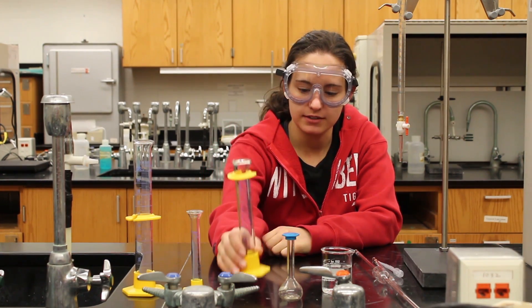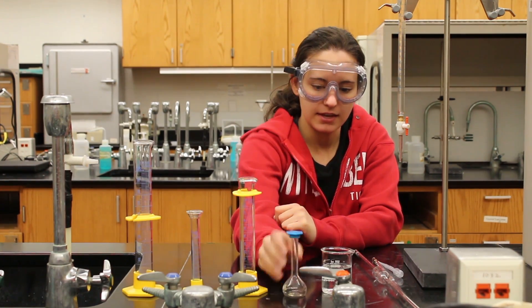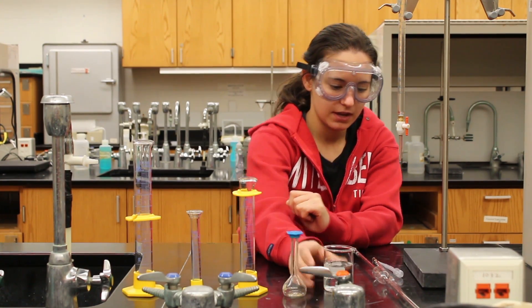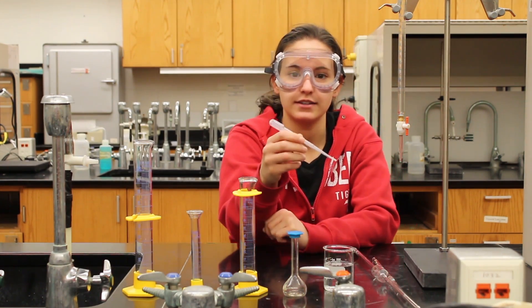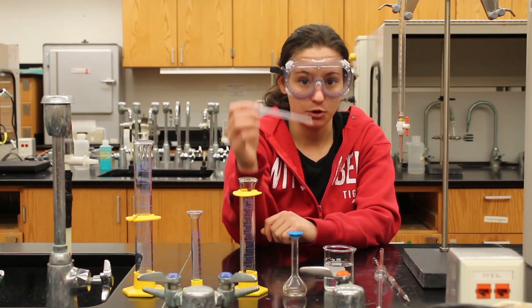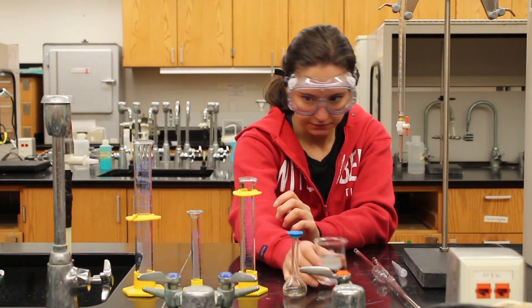This is a graduated cylinder, this is a volumetric flask, this is a beaker, this is a pipette, and this is a pasture pipette. This is disposable and should only be used once, and this is a burette.